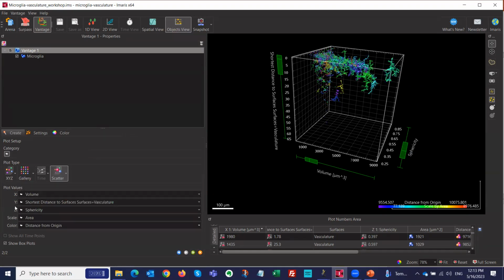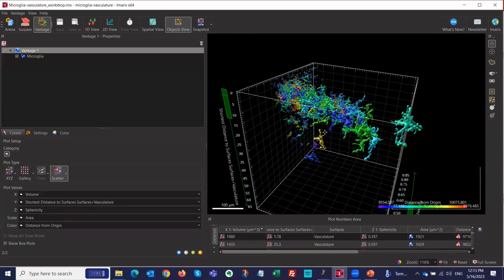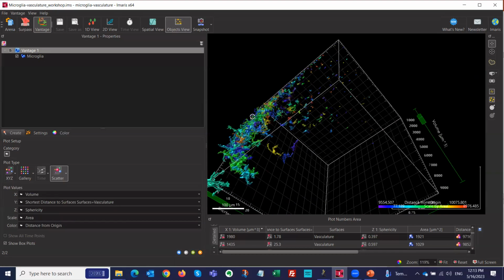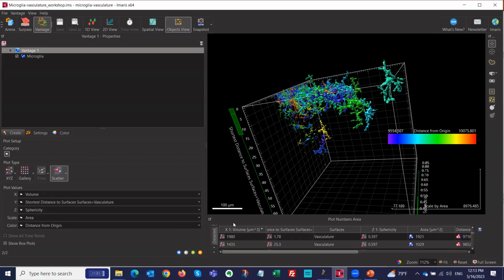Okay, so you have those 5 dimensions here to plot your data in here. Okay, so again, a lot of things that you can do, and then you have multiple legends here and scale and all this.